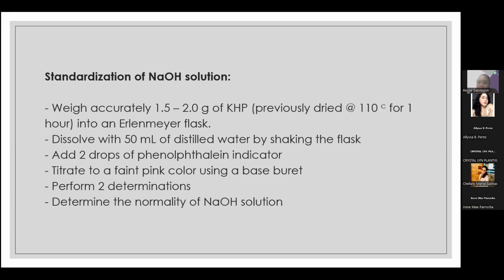And then, the supposedly sample will be used as like a titrant kasi it will be the one to be placed in a burette and added sa Erlenmeyer flask until you reach the endpoint. Okay? Again, primary standard ito.